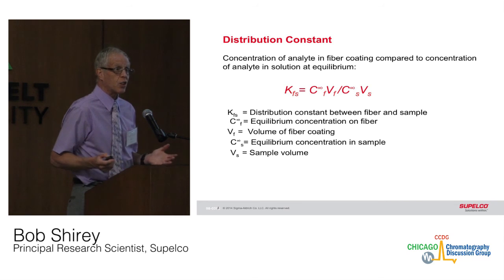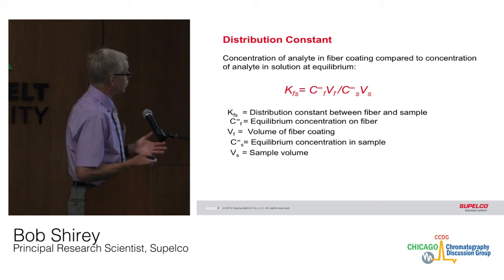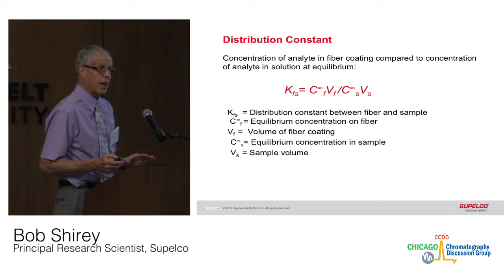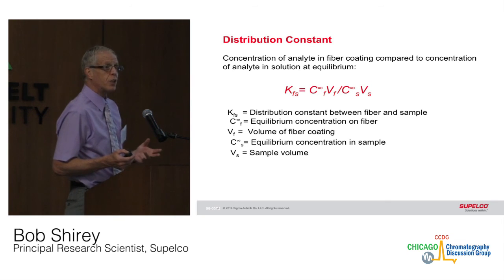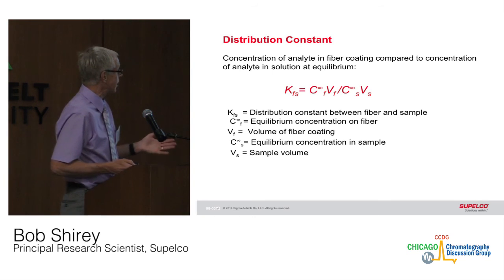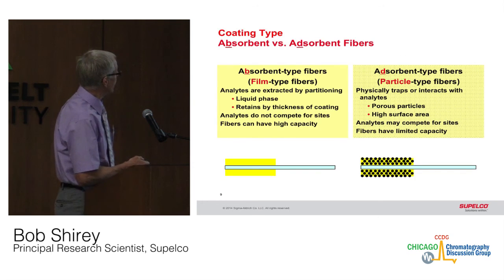The amount of analyte extracted is dependent upon the distribution constant. Essentially that is the concentration of the analytes in the fiber versus the concentration of the analytes in solution. So SPME is more concentration dependent than it is volume dependent. Using a larger volume generally doesn't gain you any advantage, because it's more concentration dependent.